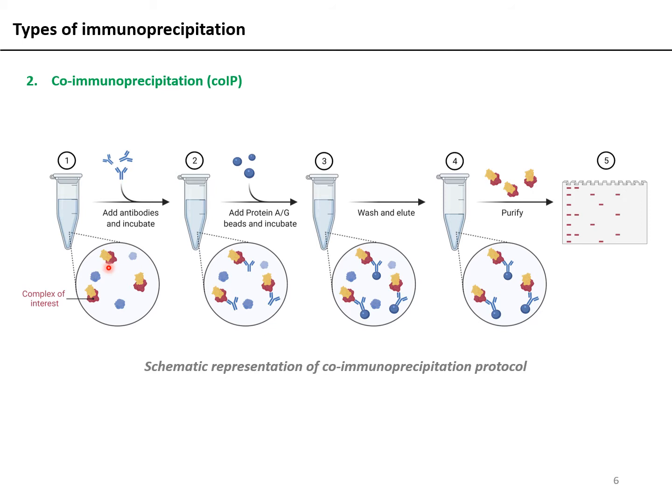So now I will go about mutating these 10 residues to see what kind of effect this mutation will have on the binding interaction. This now becomes my test condition. So I have a range of protein A mutants, and now I want to see which of these mutants are still capable of binding to protein B and which have lost this binding ability. Under such an experimental situation, a co-IP experiment becomes very useful.